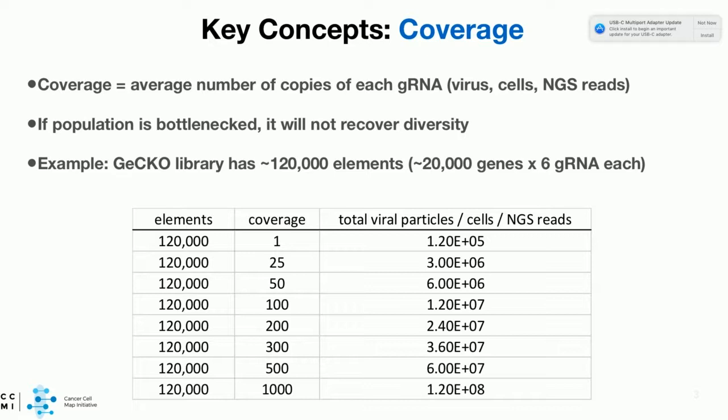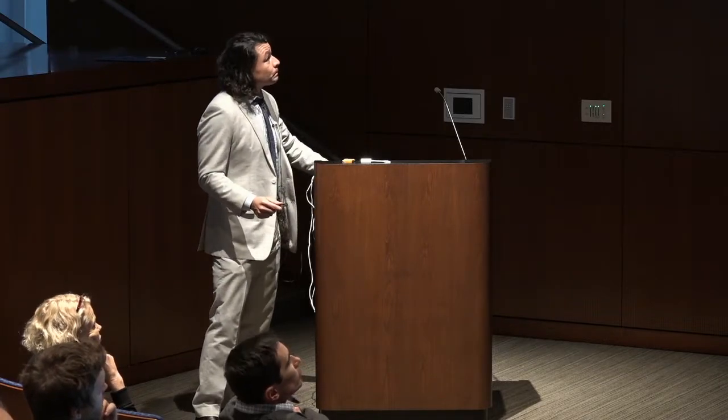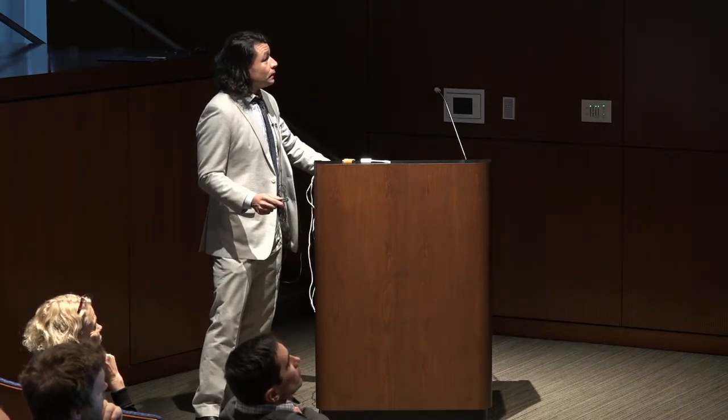How much coverage you need is going to depend on what you're trying to find. If you're looking for things that deplete, you're going to need a higher coverage. If you're looking for things that enrich, you could potentially get by with lower coverage.